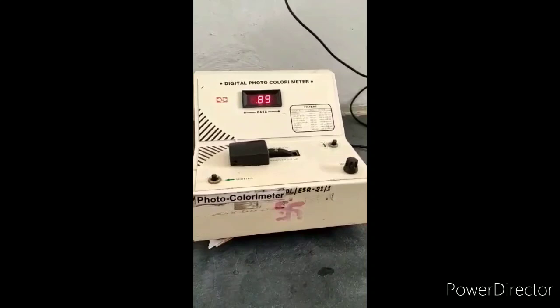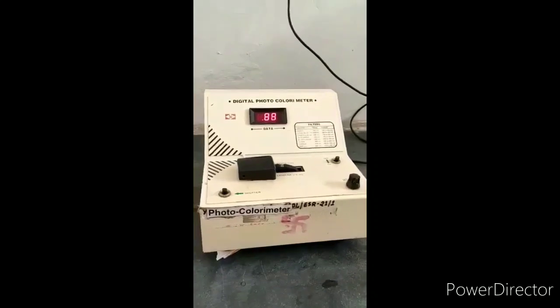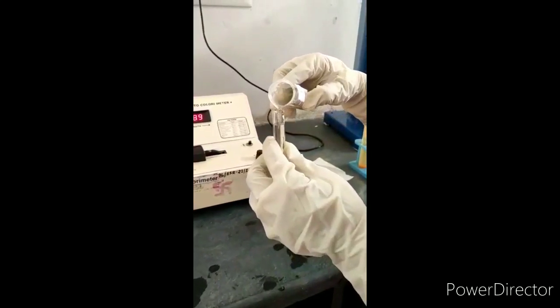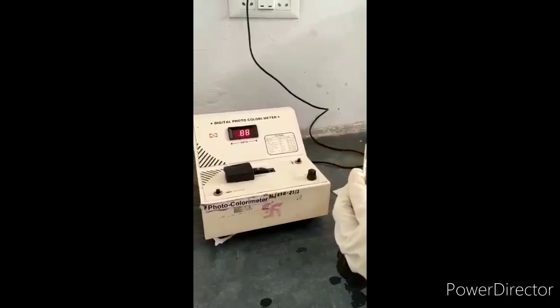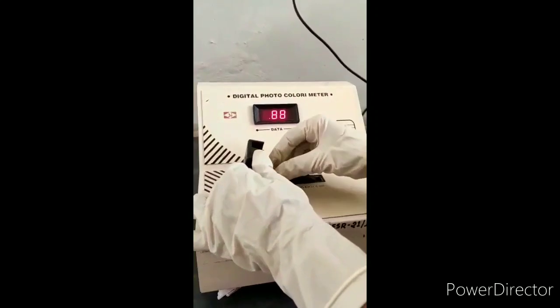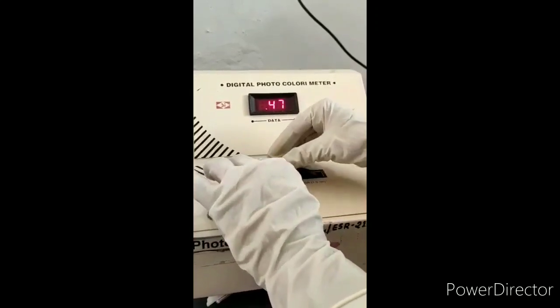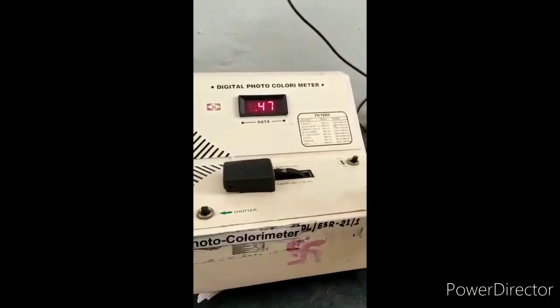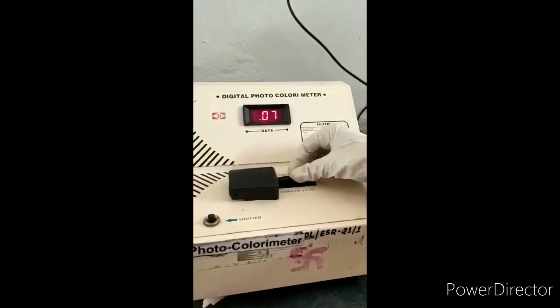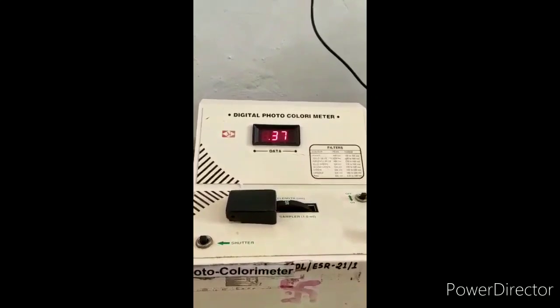Now we will fix the wavelength at 500 nanometers, using filter 500. Take 1 ml of sample solution and keep it in the sampler slot. Adjust the filter at 500. This is the final reading for the sample solution.